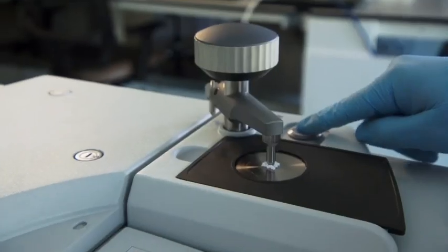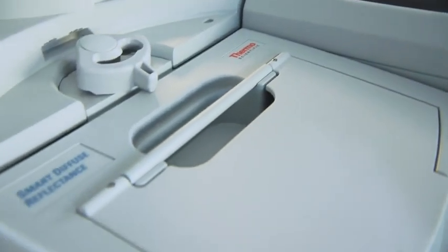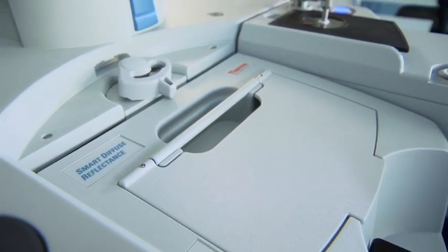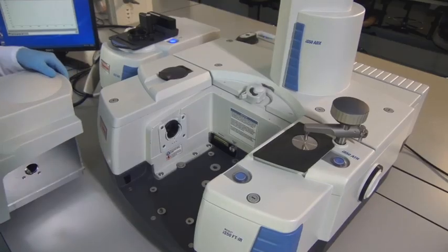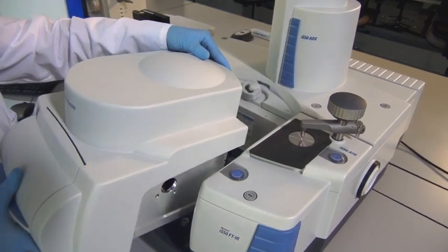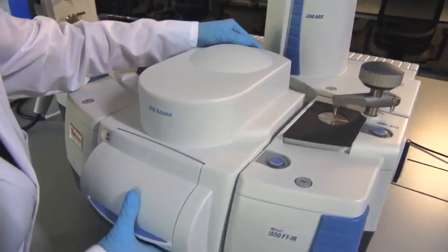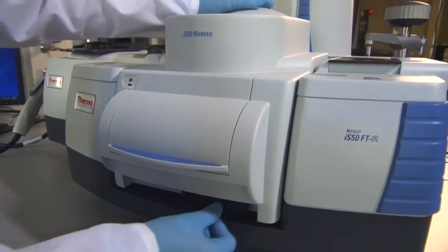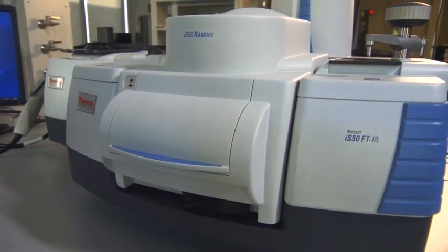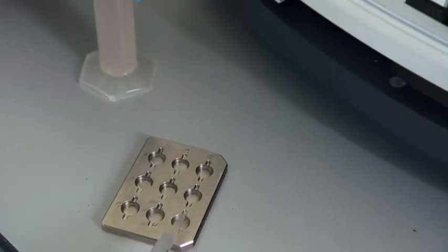Since the ATR is built-in, your sampling compartment is free for any other accessory. For example, working in tandem with a built-in ATR, the IS50 Raman module lets you rapidly switch from mid-infrared to Raman without reconfiguring optics or waiting for the instrument to stabilize.